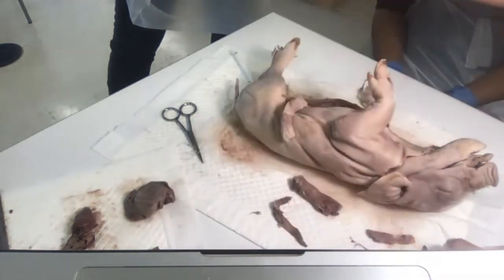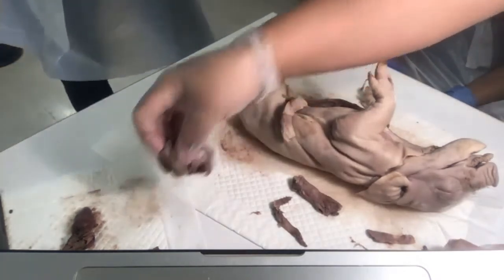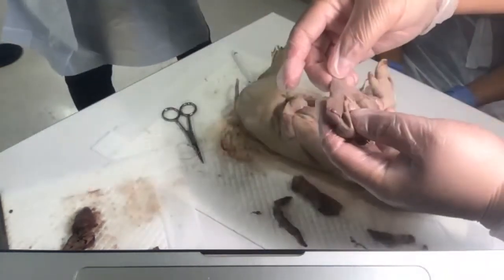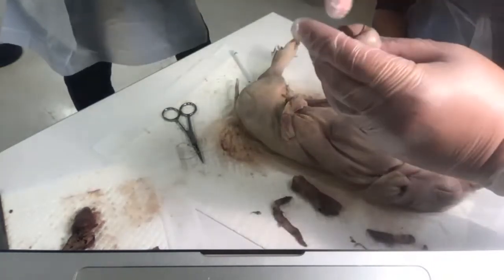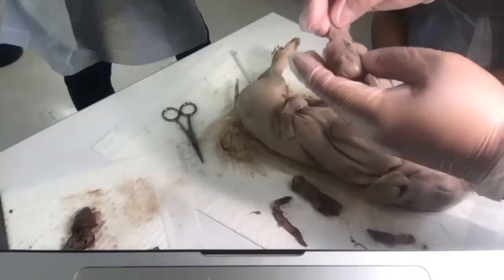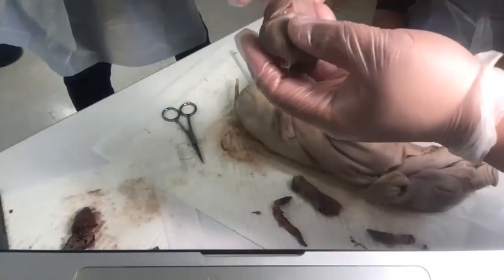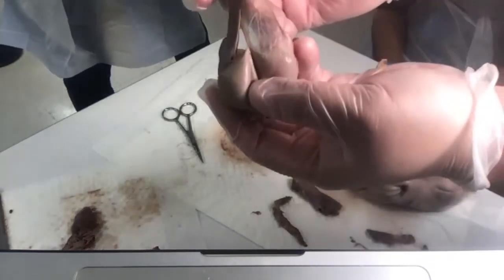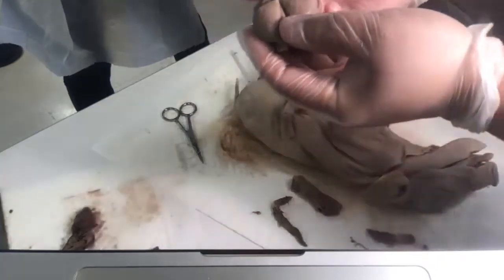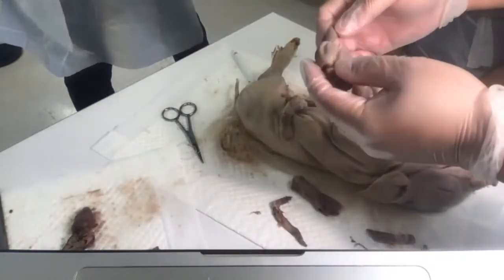So we have that. We looked at the pancreas. Now we know what the pancreas does. Now we know that ketones are bad. Oh, here's some of the pancreas. Oh, it's still there. It was hidden, right? And here's more of the pancreas. See, it looks like an eel. There's like a head and there's a tail. And you can see how it's intimately connected. And you could look here. Yet another covering, right? Fascia, and look, it's full of arteries and veins. So it not only holds my organs in place, what will it do?